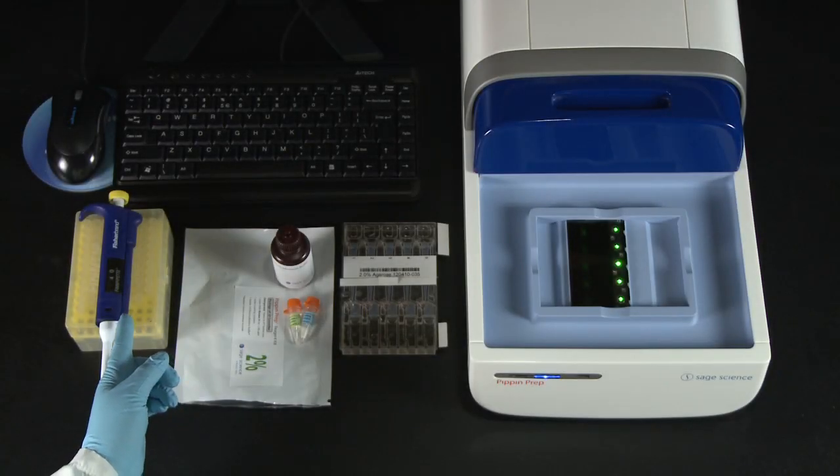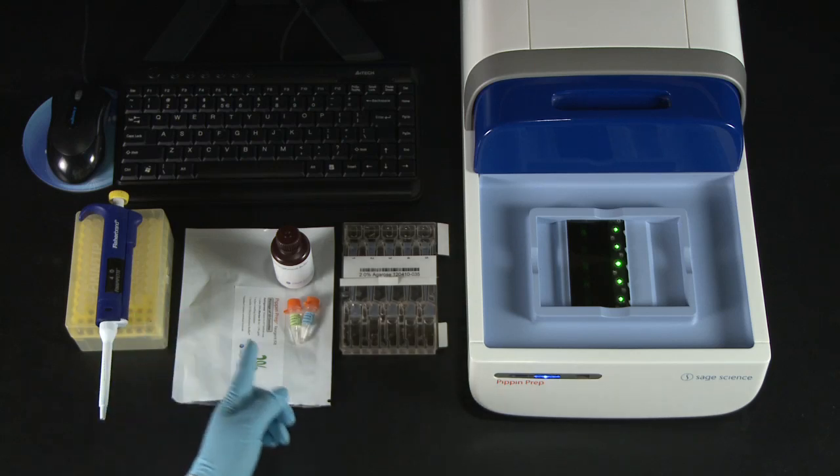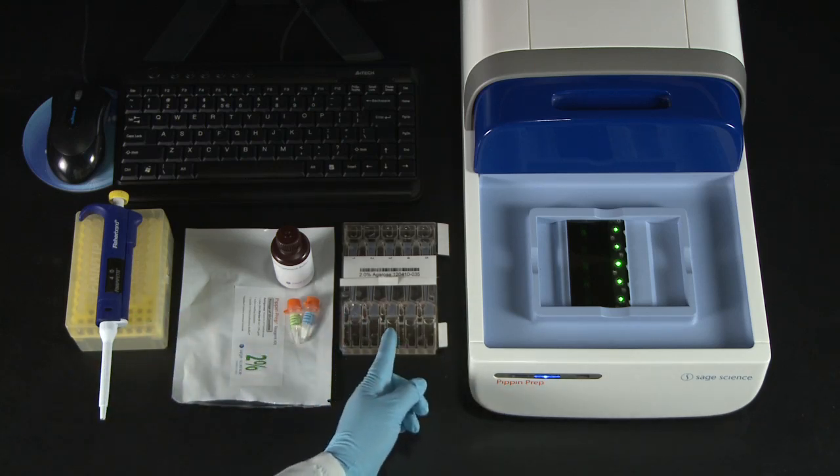You will need a P200 pipette man and tips, the reagent kit, and a cassette.